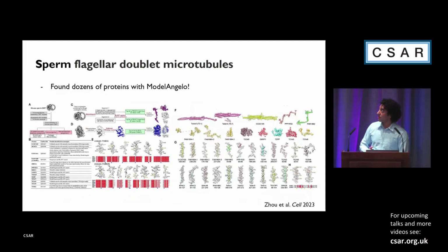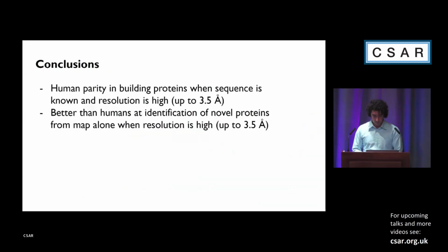And so, this program has now been available for a few months, and a lot of people have used it. And there were some very cool applications, including this one, where they were able to find dozens and dozens of proteins in sperm microtubules with ModelAngelo.